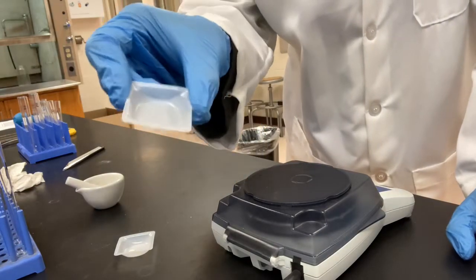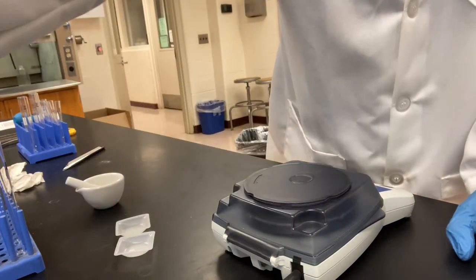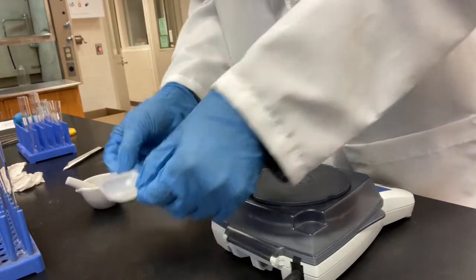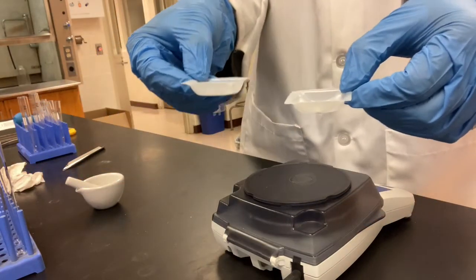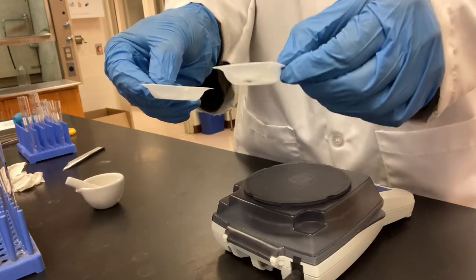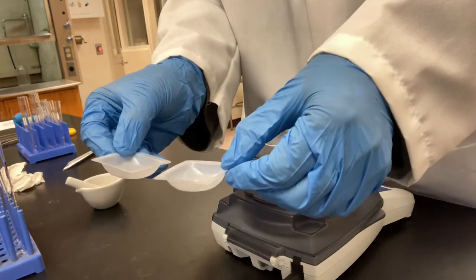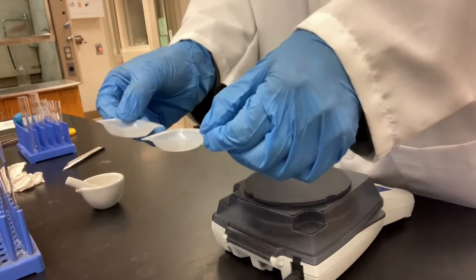a marble chip, reacting with hydrochloric acid. So we pick 2 pieces of marble chips. They're about the same size. The book says around 0.05 grams, which is 50 milligrams. Mine, I just did a measurement. Roughly, they're about 100 milligrams each. So about the same size, okay?